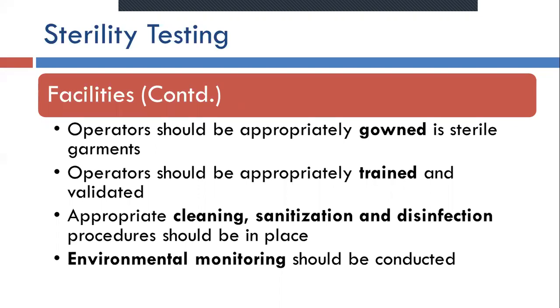And environmental monitoring should be conducted. That means air samples have to be taken, and surface samples have to be taken, for any possible presence of microorganisms in that area.